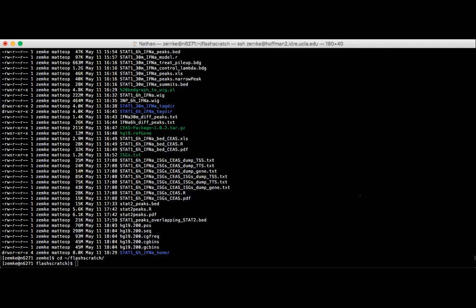So make sure you don't copy the $ if you're running the command. You start after the $ space, so you would start the command with ln space -s.